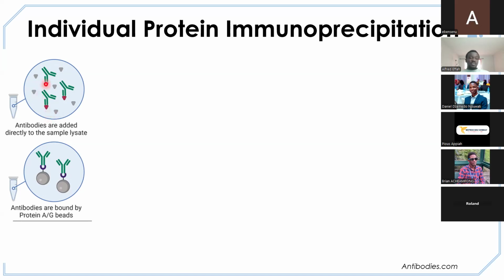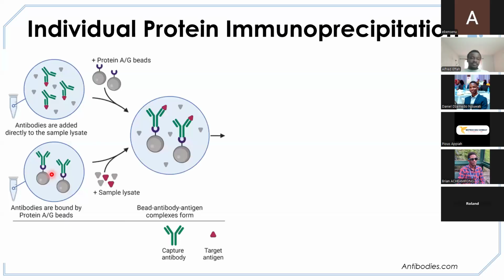Now what we do is we find an antibody that specifically binds to protein A. That is one way. We just incubate our antibody with our cell lysate. Another way we can do this is also by using antibodies. We add beads to the antibodies. In a minute, I'll tell you the purpose of the beads. So, one of two ways. First of all, we can incubate antibodies with our lysate. Then we add the bead to it. Now, the bead will recognize the Fc region of our antibody.